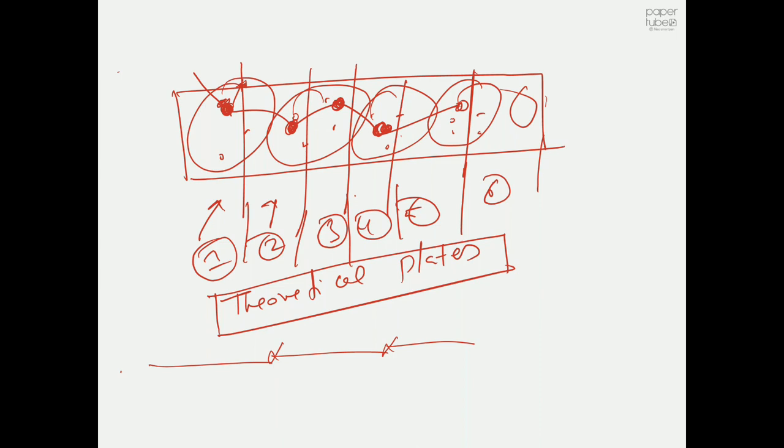And then these things happen in series, because your liquid front, which carries your eluent, which carries your analyte, is always exposed to some pure silica particle, and that's why some mass is transferring from the liquid side to the solid side. And then once adsorption happens, the fresh solvent, which looks at these already adsorbed sites, dissolves these compounds and then carries them to the next particle, and the whole process happens in series. So we have a lot of equilibrium stages happening within one column. So try to keep those things in mind.